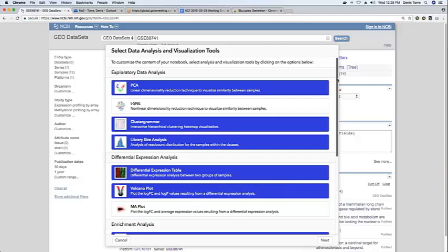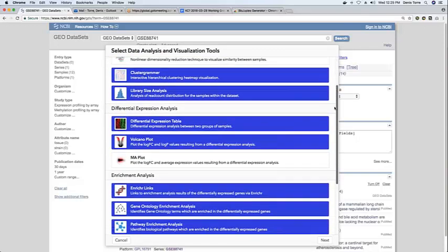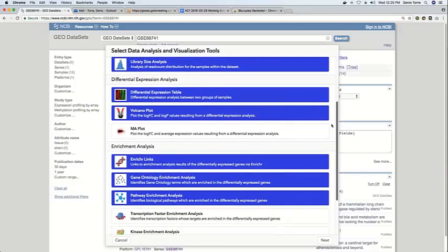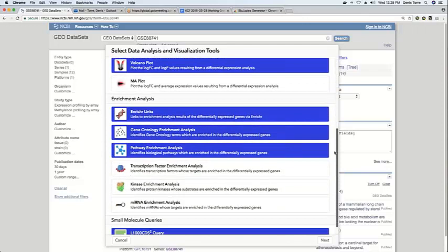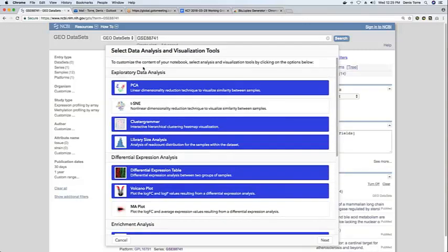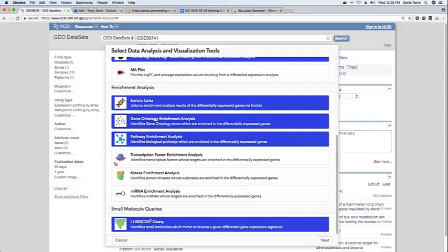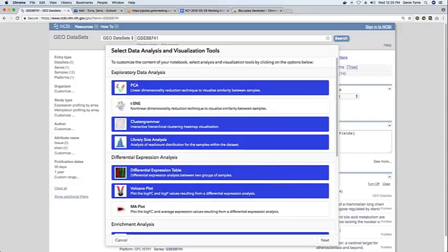So the first part involves selecting some data analysis and visualization tools that the users want to include in the notebook. So in this case we provide several preconfigured tools such as exploratory data analysis tools, differential expression, enrichment analysis, and small molecule queries. And so we already provide a preselected set of tools.